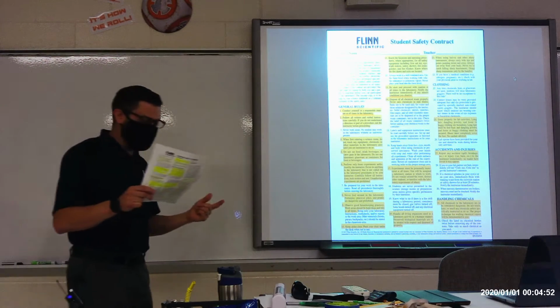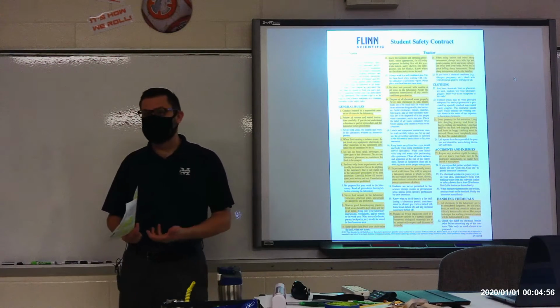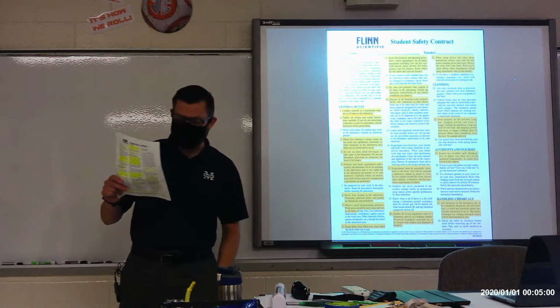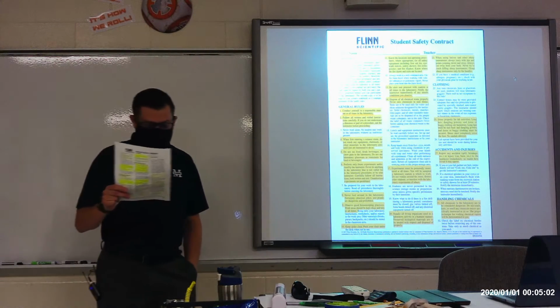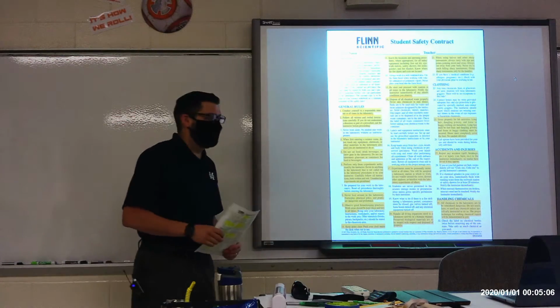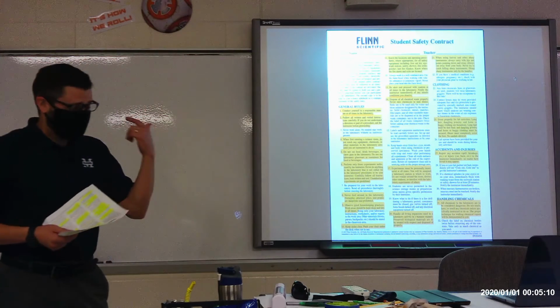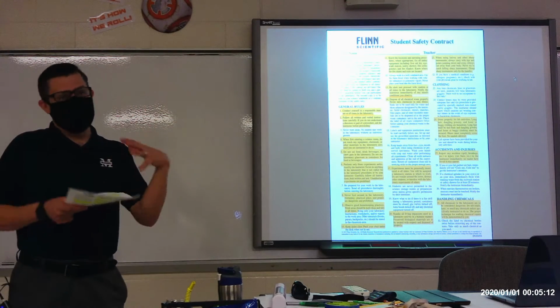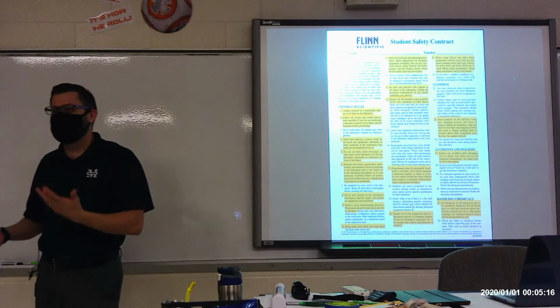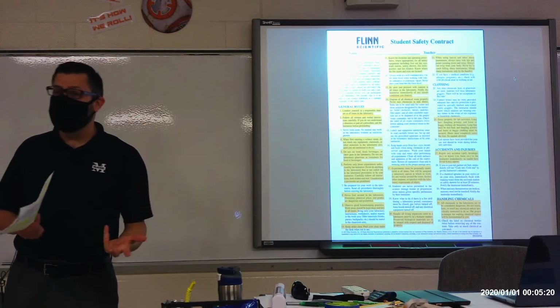Number 2, which is the second rule, but is probably the most important rule on this list, says follow all written and verbal instructions carefully. If you do not understand directions or part of a procedure, ask the instructor before proceeding. Follow directions. When we do a lab, generally I will give you a set of directions, a set of procedures. It'll often be in the form of a worksheet, but I'll also give you verbal directions as well.